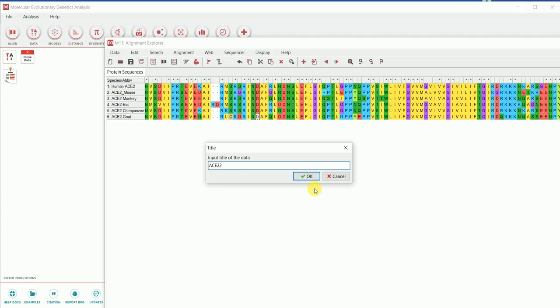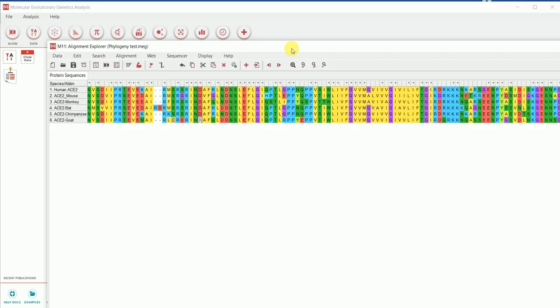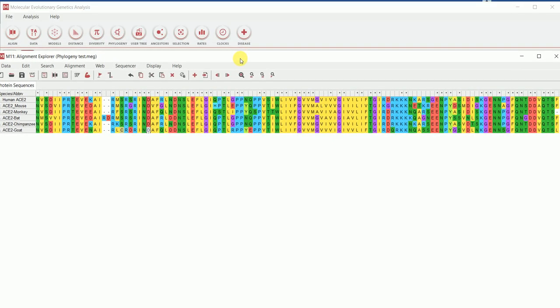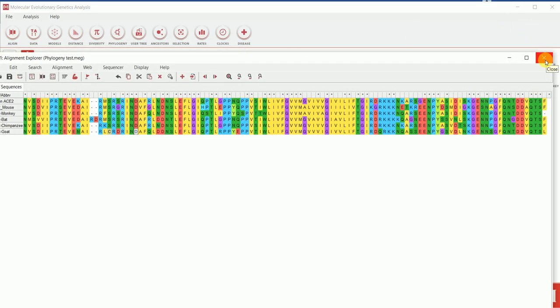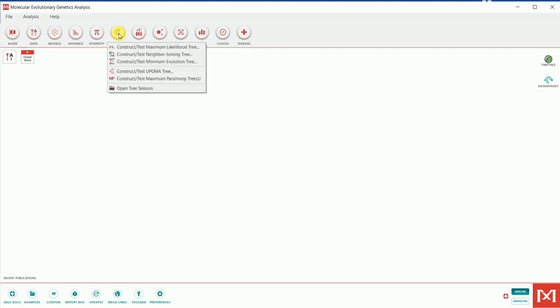Now that the alignment has been performed and saved, our goal is to perform the actual phylogenetic analysis. I'll close this alignment window and return to the main MEGA window. As you can see, there are different options available. I'll now go to 'Phylogeny,' since the sequence alignment has already been created.